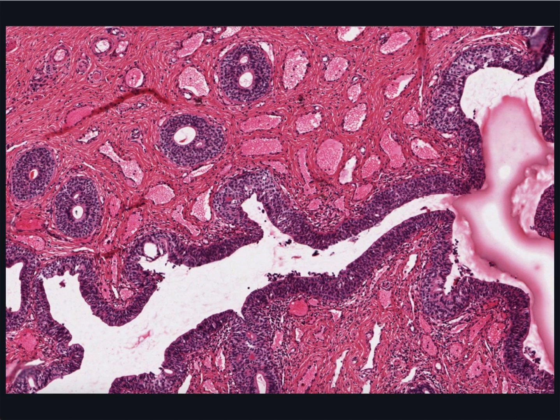One thing to notice is that sometimes smaller outpocketings of mucus-secreting cells form clusters in the epithelium and extend into the lamina propria as single glands. These are called the lacunae of Morgagni. Those in the epithelial layer are examples of intraepithelial glands. But again, they're not visible in many sections you may look at.